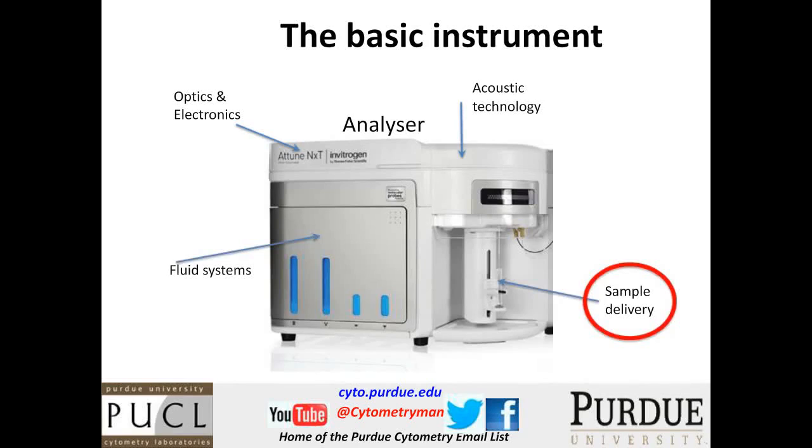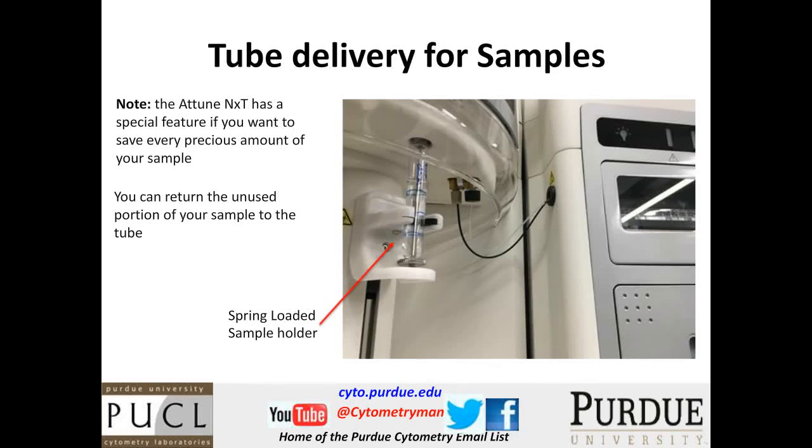So let's look at the actual sample delivery. And this has some interesting features that I noticed on this instrument too, that I found quite attractive. So this is the sample tube, and the system is pretty much the same as other instruments in that you can stick a tube on here.